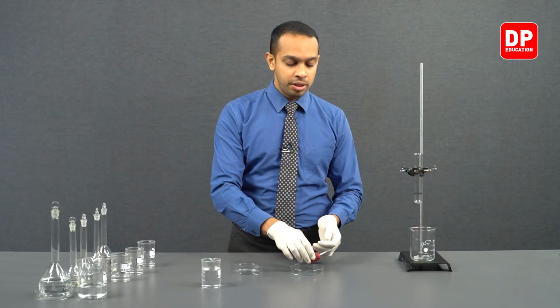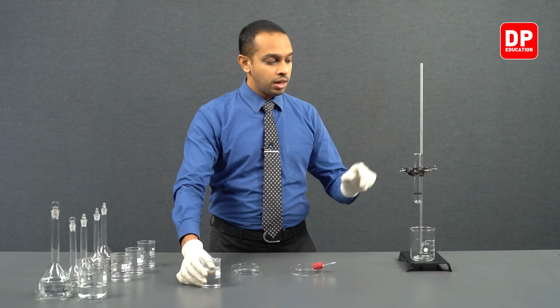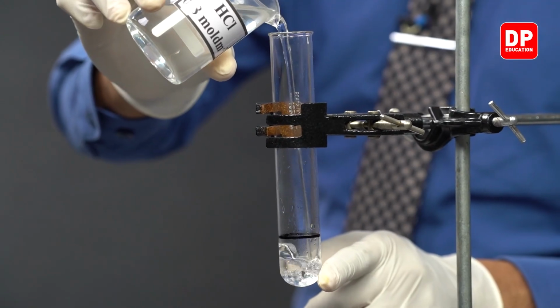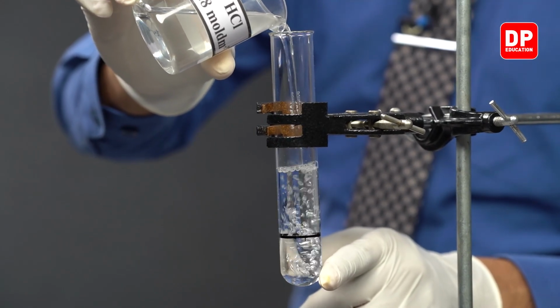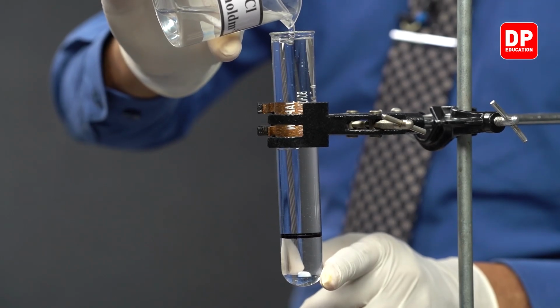After placing it securely, we are going to be filling our boiling tube with 0.8 moles per decimeter cubed concentrated HCl all the way to the top.